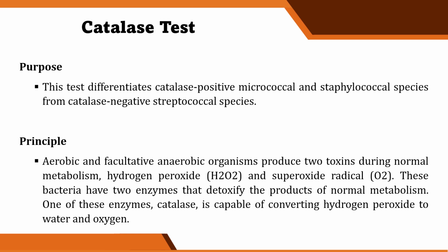So, used most commonly to differentiate members ng catalase positive Micrococcaceae from catalase negative Streptococcaceae. Some variations din, we can use this for identification ng Mycobacterium. Okay? So, modified catalase test, ginagamit natin for Mycobacterium species.